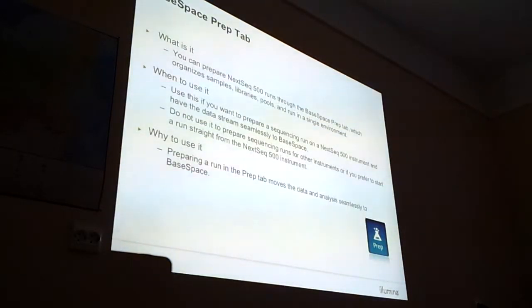So in this, if you click on this prep tab, you can organize samples, libraries, pools. Basically, this is what you would do on Experiment Manager. Same idea, same function. And you use it if you use BaseSpace cloud.